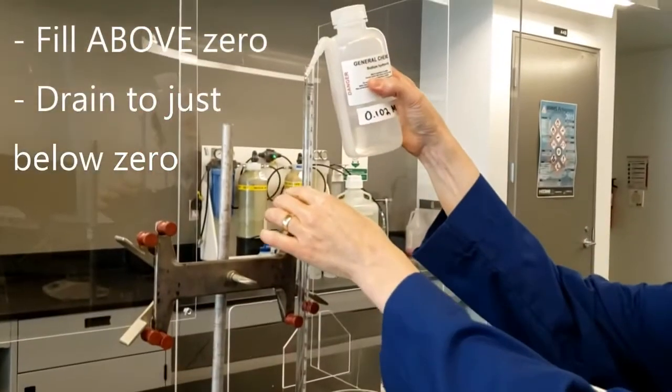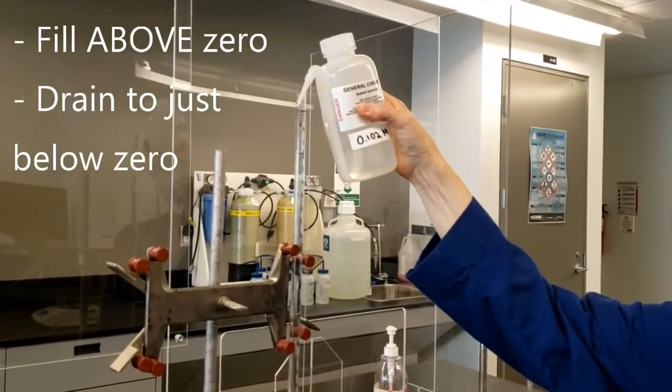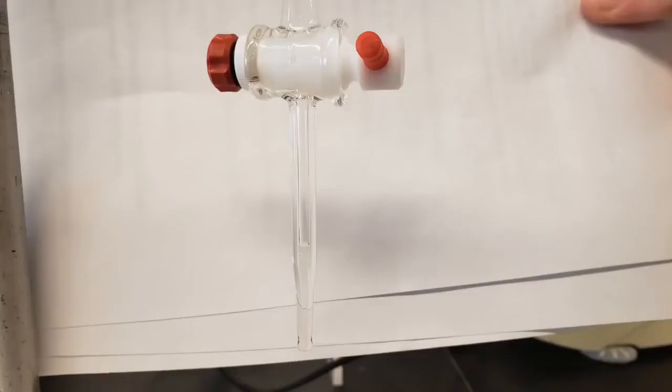Place the refuse beaker under the burette and turn on the stopcock full force, allowing the titrant to drain a bit below the 0 mark. This full force drainage is meant to eliminate any air gaps in the stopcock and tip. If you notice an air bubble at the tip of your burette, drain a little bit more of the titrant. This should eliminate the air bubble.